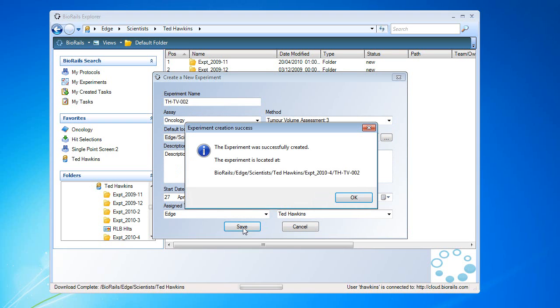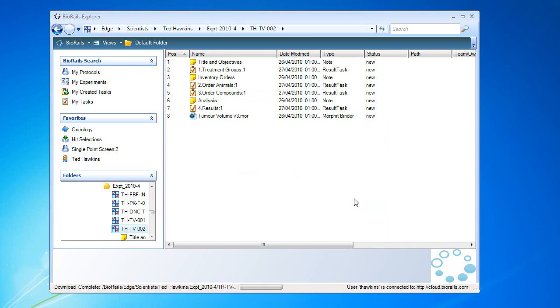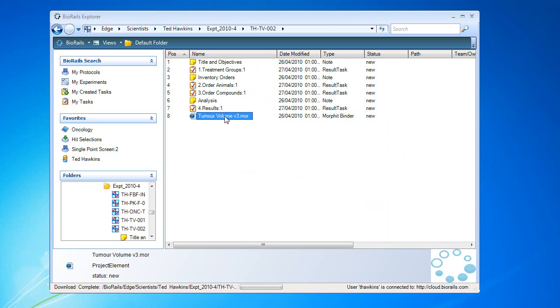This has created a new experiment based on a templated protocol. The desktop will update with the experiments folder and present me with all the contents of the experiments folder, including the BioRails, including the Morphid binder.